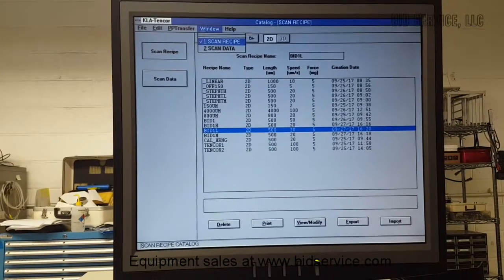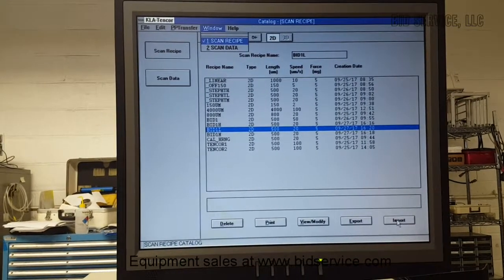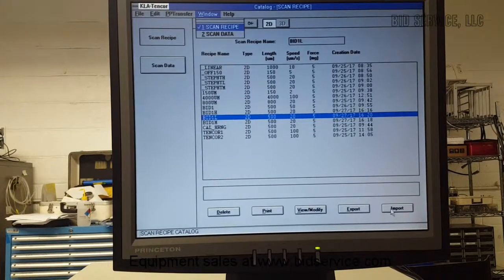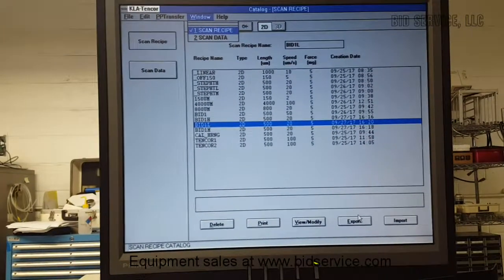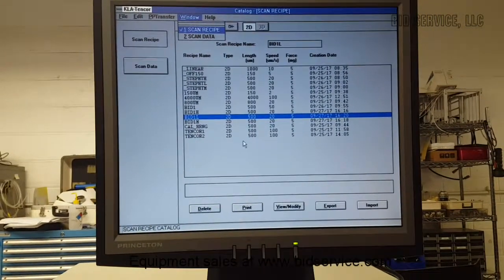There is a port available, and any hard drive less than 2 to 4 GB can be connected and used as a backup drive for this system. So it provides additional memory space for the data.